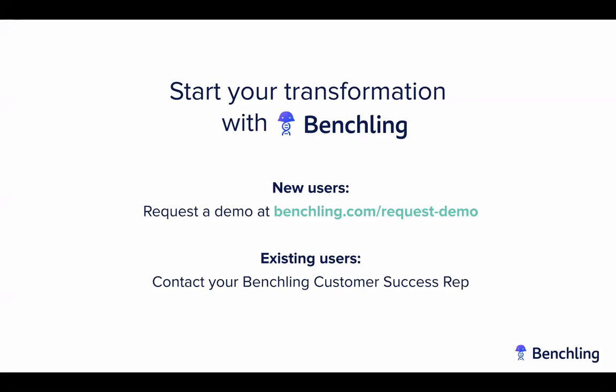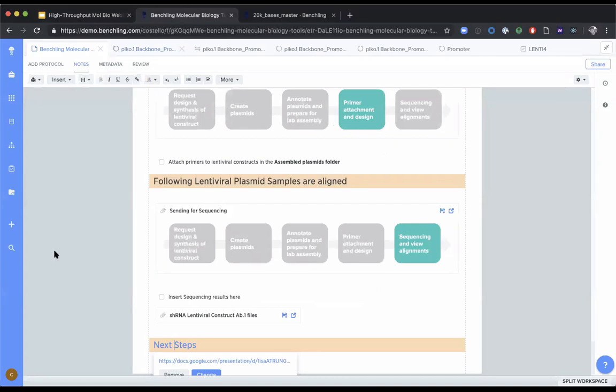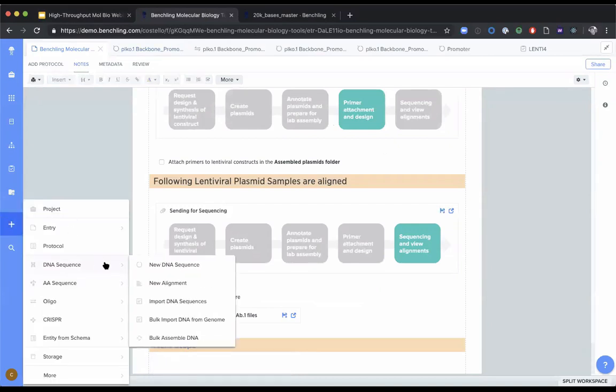Let me scroll down. Sorry, there's another question. Are sequences stored on my computer or dragged from a database, for example NCBI? So just to show you a quick look back, it's similar to the API question.